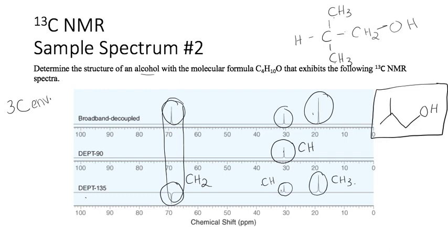I have my 4 C's, my H's, and then I have everything bonded according to what's here. Notice that for the integration, there is none, so that didn't help me. I had to piece these together based on what those different parts per million values were.